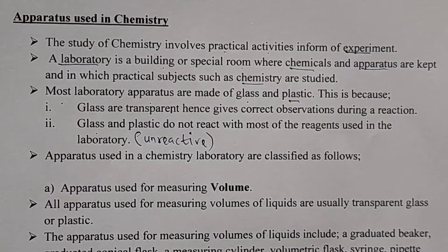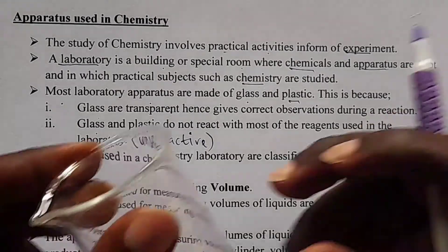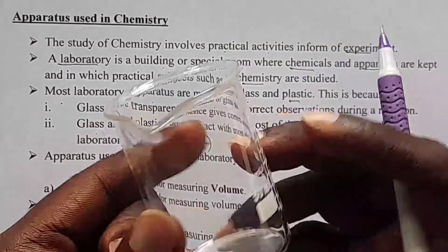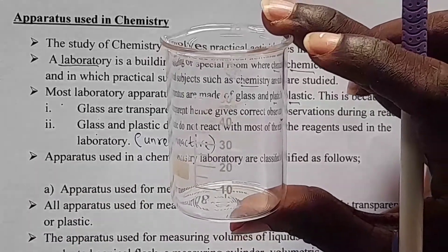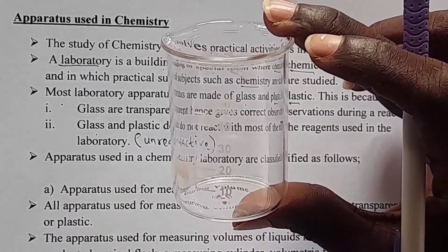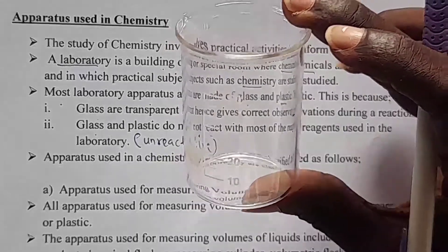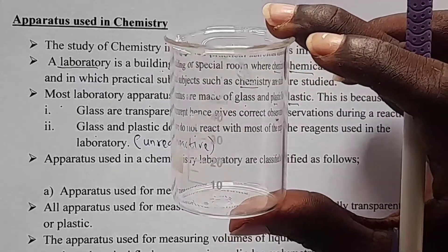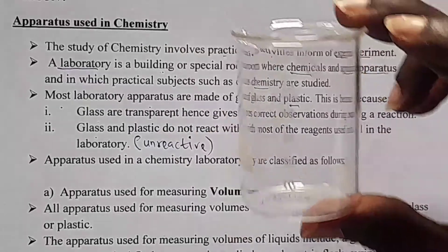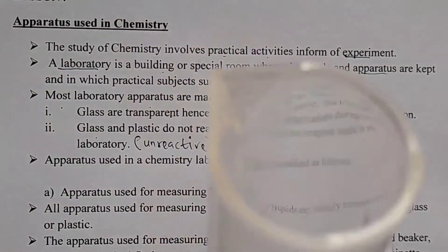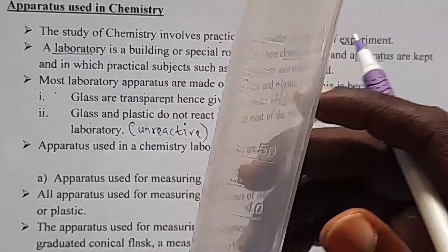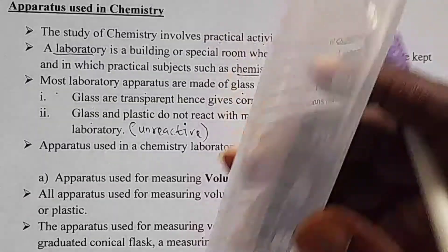We have some apparatus that are made up of glass. It has readings and it is glass, meaning you can read what is inside, you can observe what is inside, and you can read the meniscus very well. That is an example of an apparatus made up of glass. We can also have one made of plastic. Here we are using a glass measuring cylinder — you can see the meniscus.